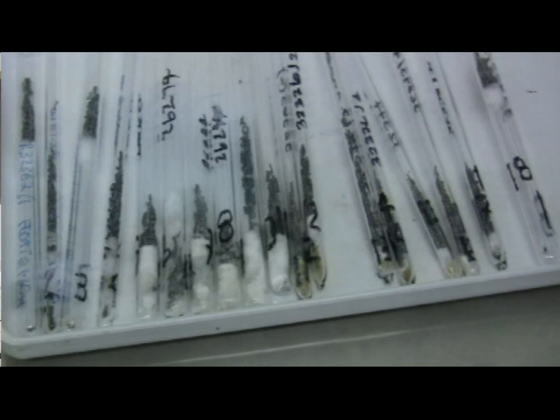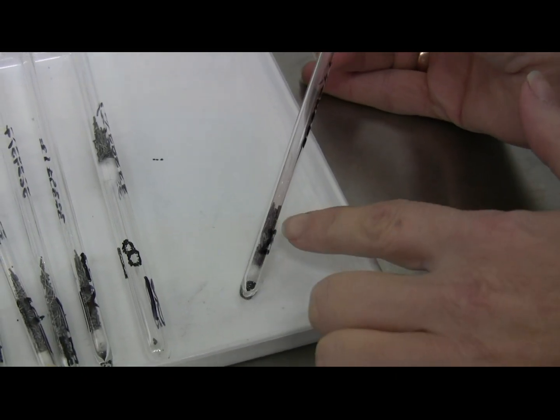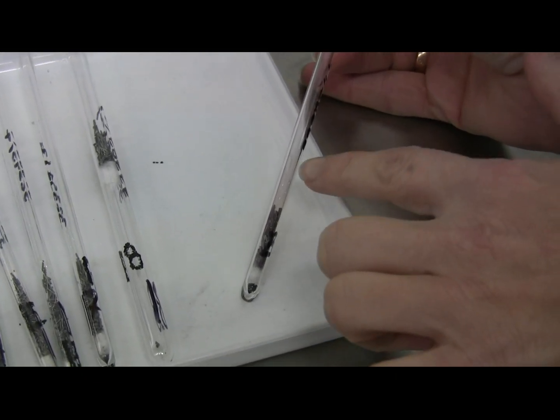The next step is to convert the solid sample to carbon dioxide, and then to convert the carbon dioxide to graphite, for measurement in the accelerator. We load the sample into a quartz combustion tube with copper oxide and a little bit of silver wire.